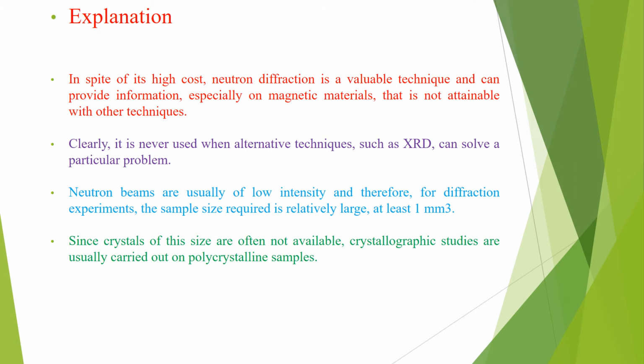These are present in different countries like France, UK, and some other countries. In spite of its high cost, neutron diffraction is a valuable technique and can provide information, especially on magnetic materials, that is not attainable with other techniques.